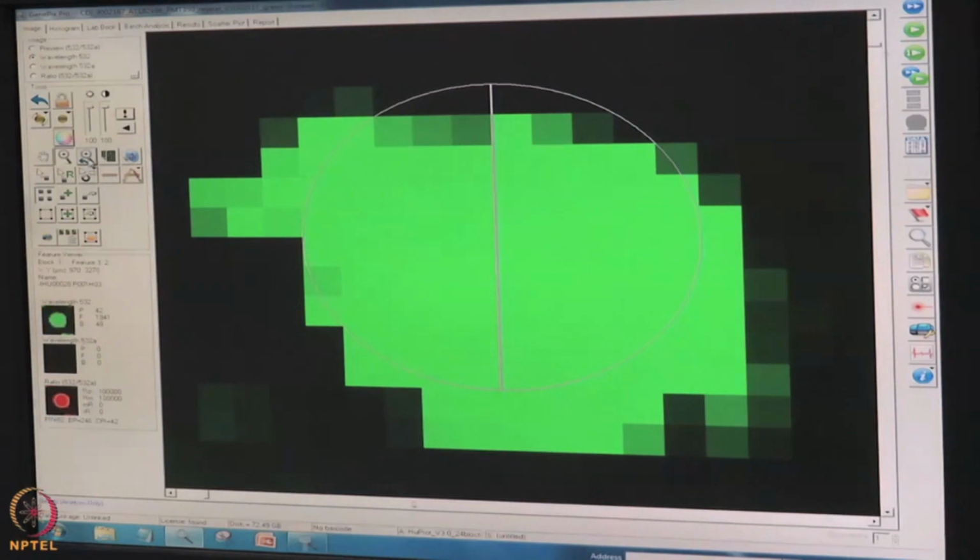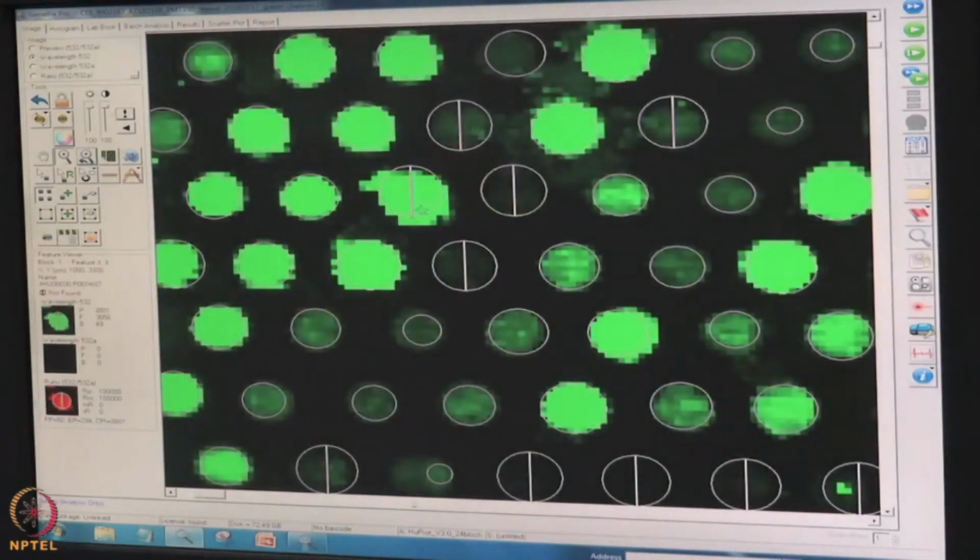because the background intensity is way more compared to the actual spot. But here you see these are the spots in duplicate, and you can see that this spot is a spot and it is not an artifact. So you will just have to press F and resize it and take it as a spot. Again, here if you see, these two spots are the diagonal duplicate spots. So this is also a spot, but because of this background it has not considered it as a spot.